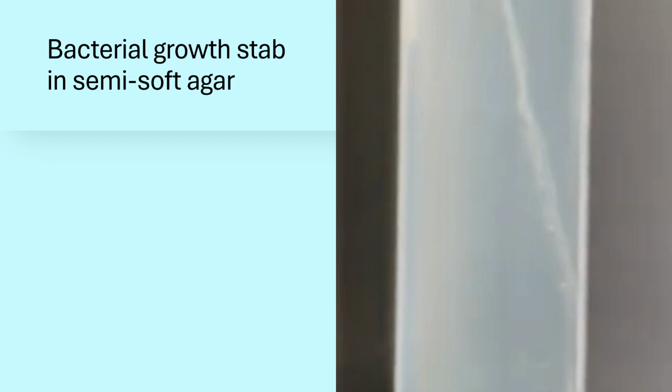And like I say, you're going to do this as a means of just adding another piece to the puzzle, trying to figure out what is the organism that you have, what are some of the characteristics of it.